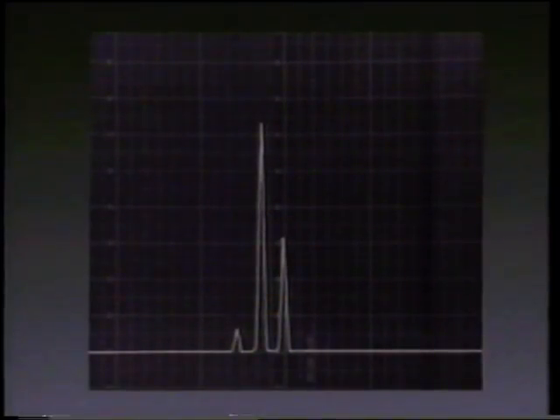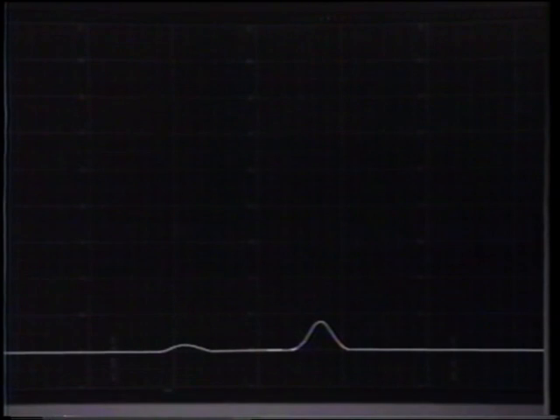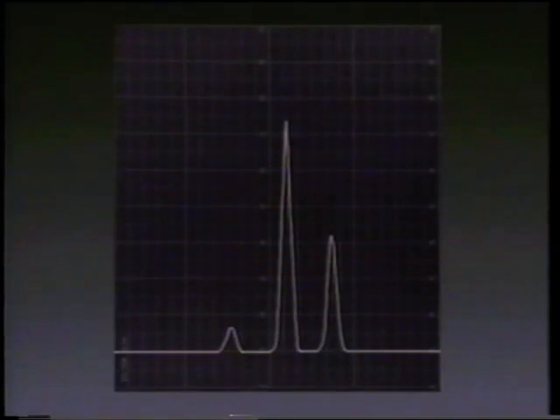Oven temperature can directly affect the analysis. Excessive heat affects separation, resulting in peak interference, which is the overlapping of peaks. However, excessively low temperatures can cool the sample below its vaporization point. Notice the effect on both column peak and width for this sample where oven temperature is too high. When oven temperature is lowered, this is the resulting chromatogram for the same sample.